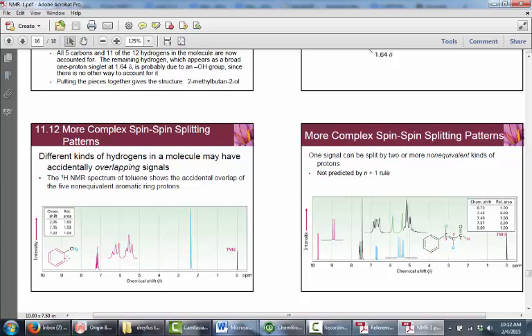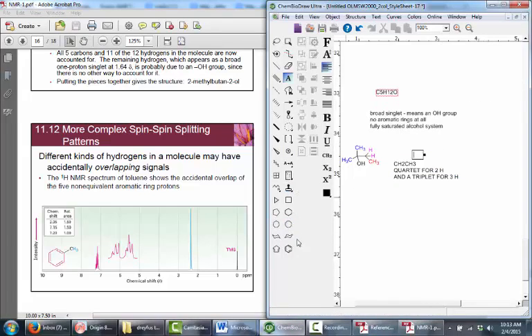But the toluene signals, with just the single monosubstituted benzene ring, actually have three chemically non-equivalent groups of protons, right? Chemically equivalent protons, the ones that are ortho or meta or para to that substituent. So in theory, you should see 3 different signals. What you have in the case of toluene is accidentally overlapping signals. So let me show you what I mean for this toluene molecule.